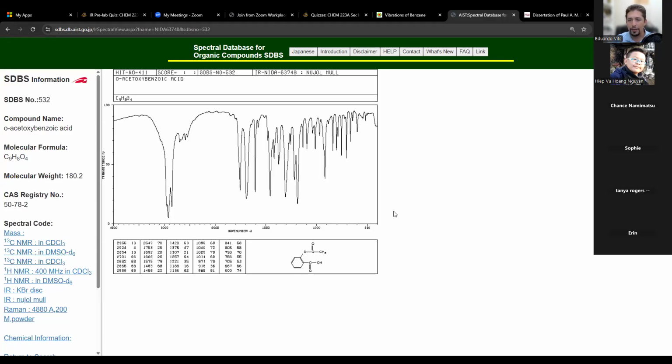So look, we have two carbonyls and we have a carboxylic acid. Oh, actually, this is an interesting example here. We have two carbonyls and they are both in different functional groups. So they should both have different wave numbers. So we should expect two carbonyl peaks. So let's check it out. Let's go to 1700. So here's 15, 16, 17. So 1700 is right here. And look, I see one and I see two right there. You see that? Both of those are carbonyl peaks. Because look, we have a carbonyl right here and we have a carbonyl right there. You see that? Make sense?